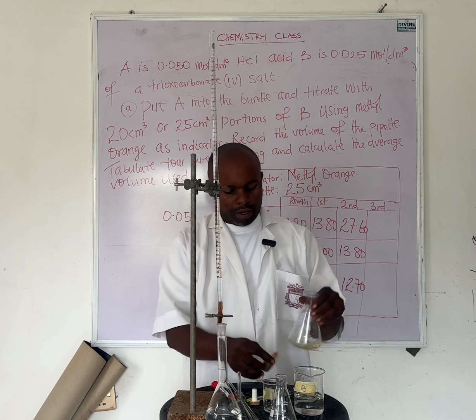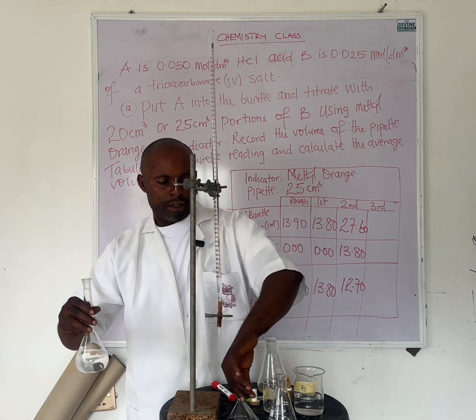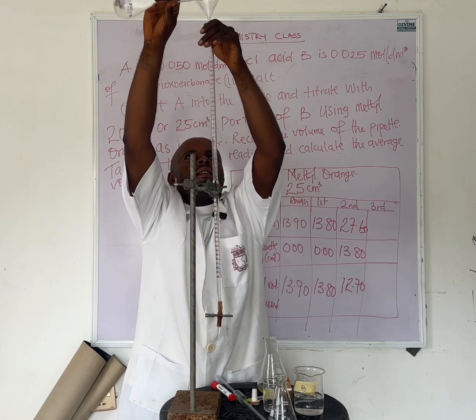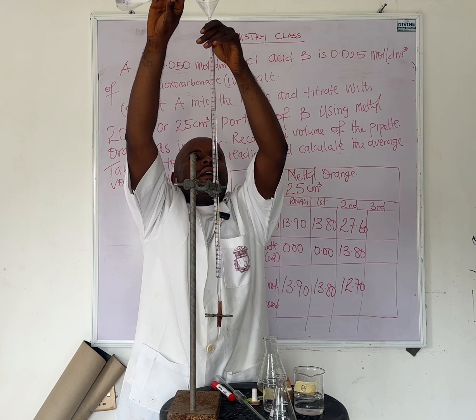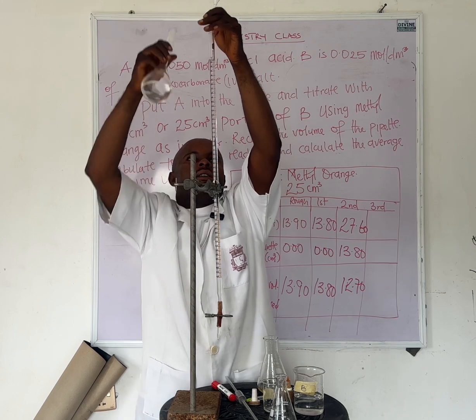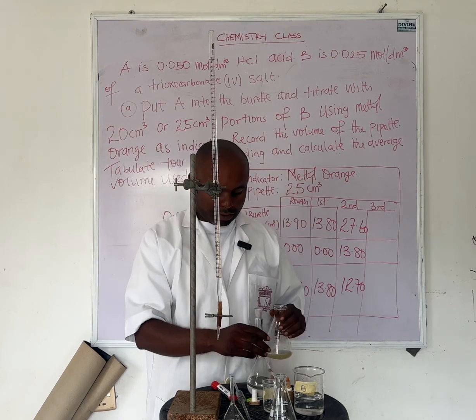All right, we're going to refill. Let's refill this. Okay, let's say we started with a different parameter so that we know what to do.